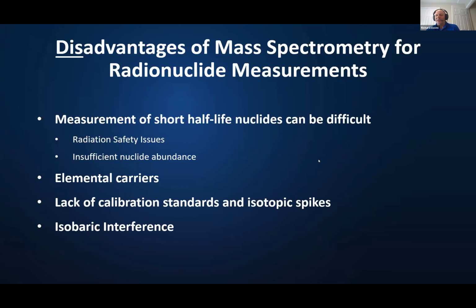there's a point, and I think we'll probably touch on this more in a discussion tomorrow, which is issues of traceability. One of the things that we saw in at least one of the talks was using assumed or IUPAC values for the natural isotopic composition of some element that we use to calibrate for mass spectrometry. These are essentially evaluated data values, but in nature these frequently vary.